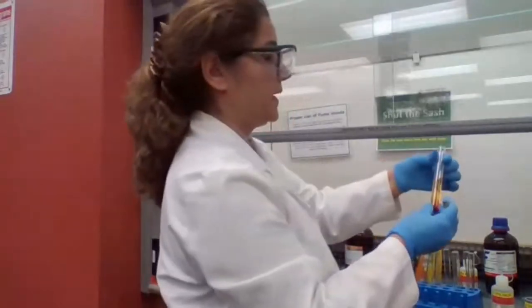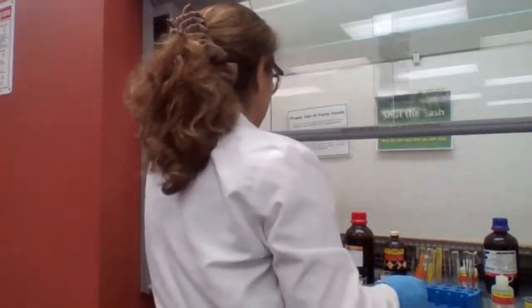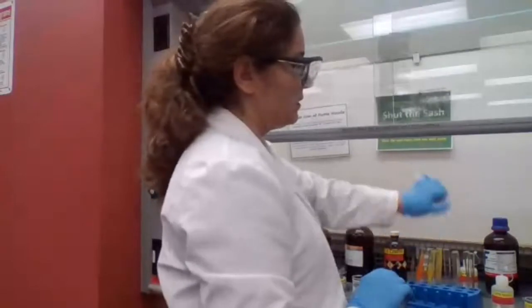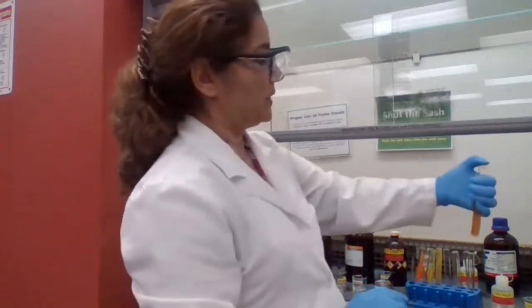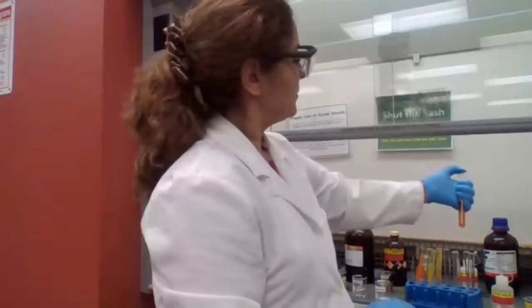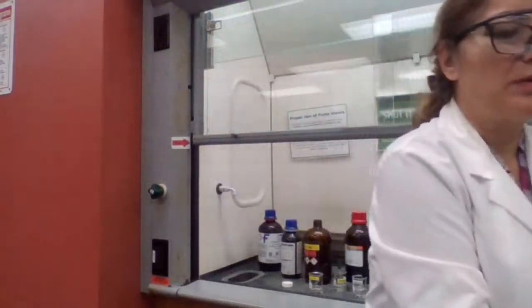It didn't form. I didn't see the precipitate, so just going to have to wait for the acetophenone, see what happened with the acetophenone. Maybe I have to mix it well and wait longer, but it didn't form. Okay.